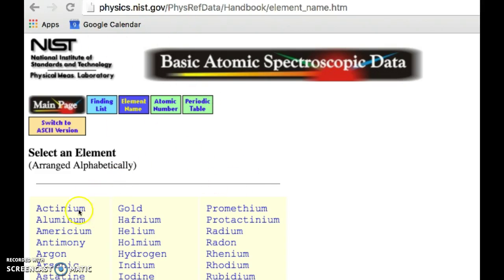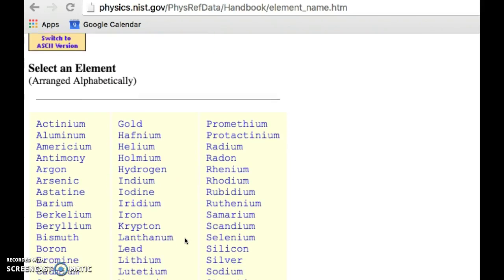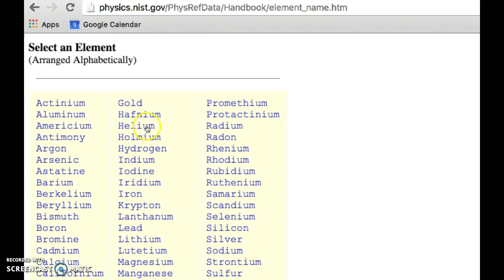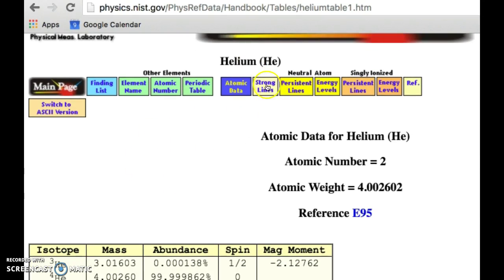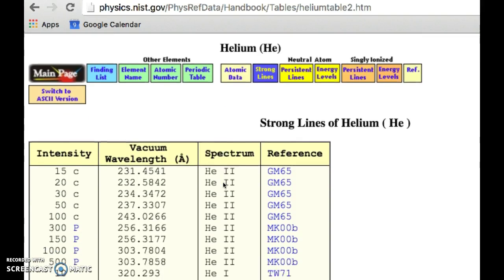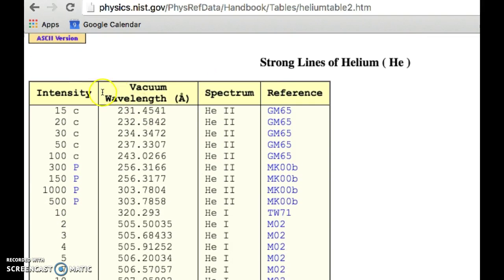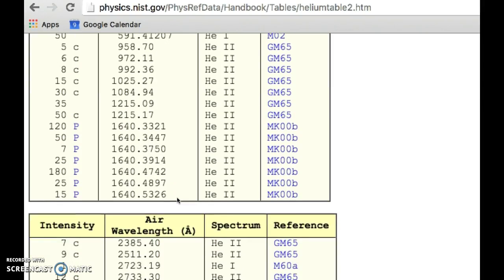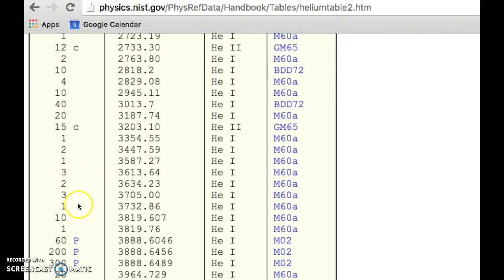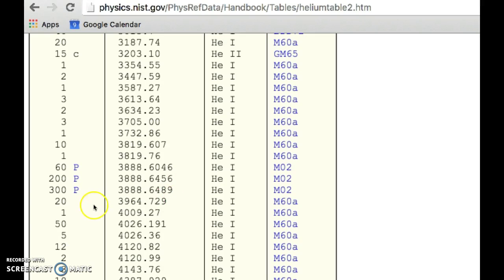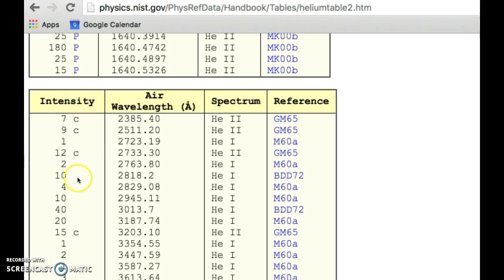Real quick, this is what the NIST website looks like. And you can see here at the bottom, there's all of the elements that could generate lights listed here. So for example, if I'm working with helium, I'm going to click on that, and then it shows me helium, and then I want to find my strong lines. And then, since I'm making my measurement in air, I'm not going to choose vacuum, and I'm going to scroll down here to air. And this is listed in angstroms, which is 10 to the minus 10 meter. So to go to nanometer, you have to divide all these numbers by 10.